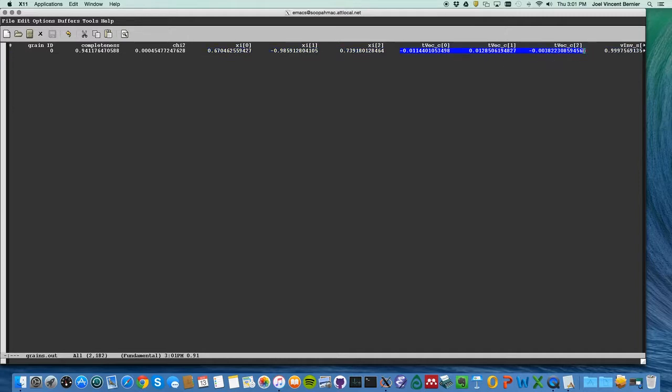Based on my detector calibration, these TVEC 0, 1, and 2 are the center of mass coordinates of the crystal in the lab frame, or sample frame rather, and those are in millimeters. So you can see it's something like 11 micron, 11, 12, and 4-ish microns for the center of mass of my 153 micron crystal. This was centered, so even without doing a more careful calibration using this Ruby itself, I'm getting reasonable results since I already know that this was a manually centered crystal.